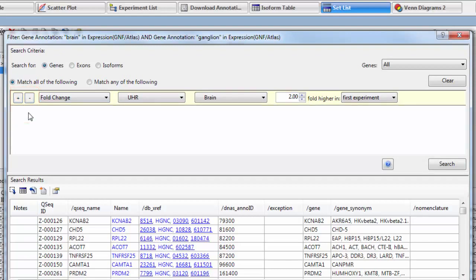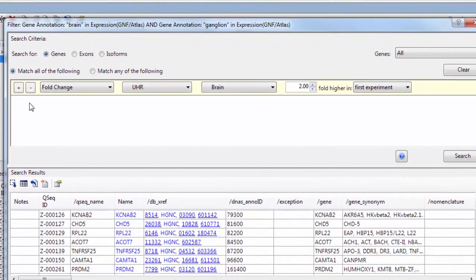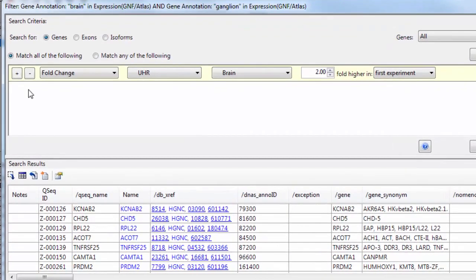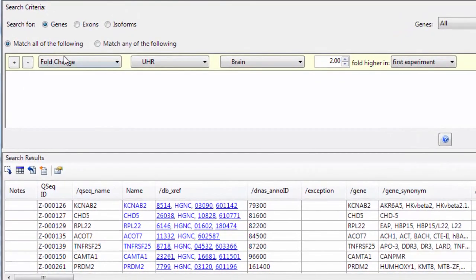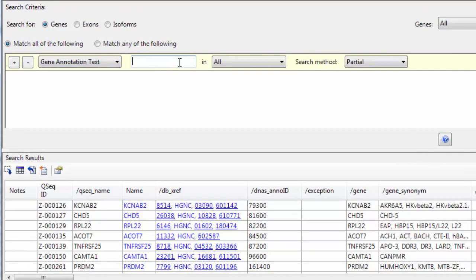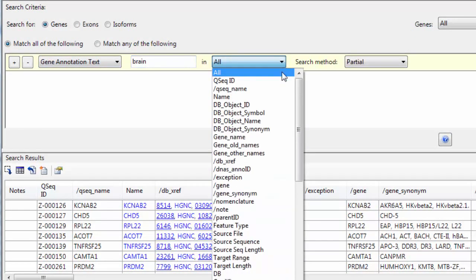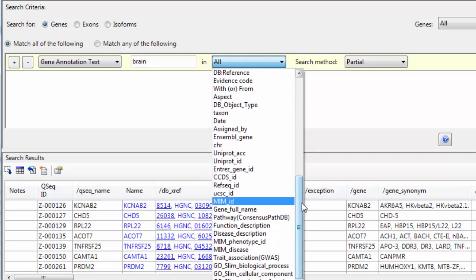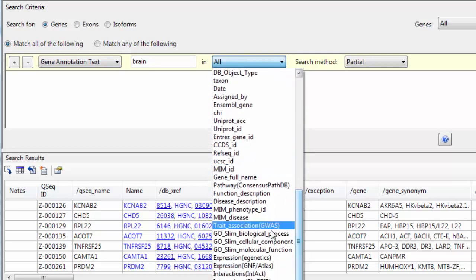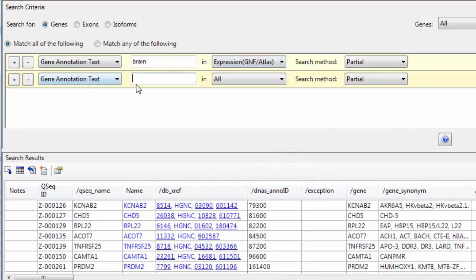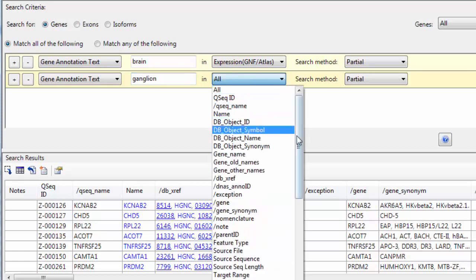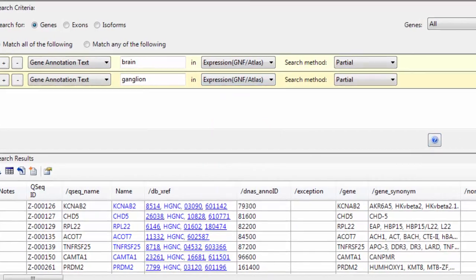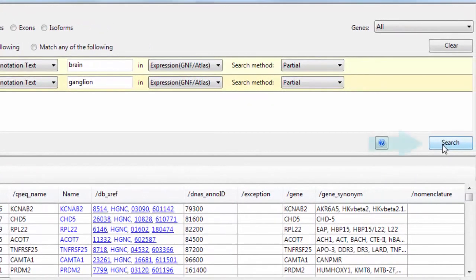I've already imported annotation data for my project, so I'm going to search for genes that have certain annotations associated with them. I'm going to choose gene annotation text, and I'll look for the term brain, and we'll search our gene expression annotations. I'll add one more to search for the term ganglion, and I'll click search.